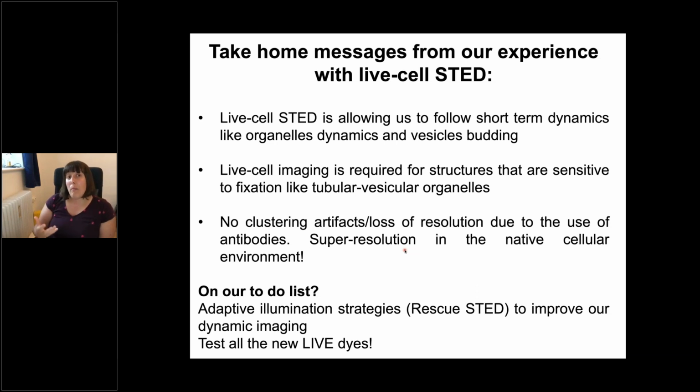So our lab's take-home messages from our experience with live Cell STED is that it allows us to follow short-term dynamics, like organelles interacting with each other and vesicle budding. Live cell imaging is also required for structures that are sensitive to fixation, like tubular vesicular organelles, and also mitochondria.